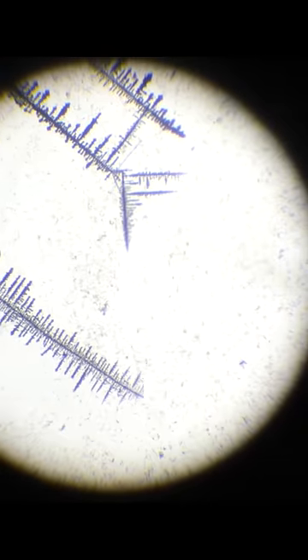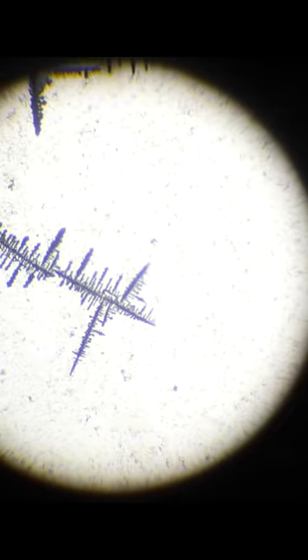What's really neat is that you can see the growth always makes right angles in this case. That's because this is the direction that's the most energetically favorable according to its crystal structure which looks like this.